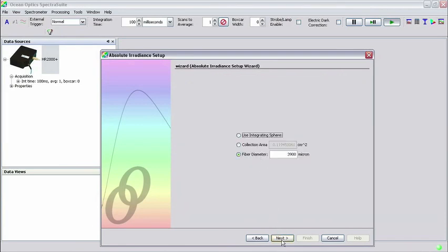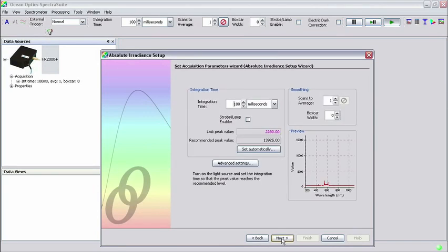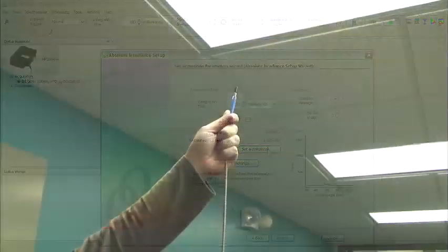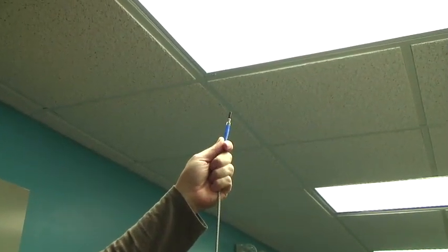In the next window, a fiber diameter of 3900 microns should be automatically populated. If so, click Next. At this stage, you should be pointing the cosine corrector at the sample that you wish to measure. In this tutorial, we'll measure the overhead fluorescent lamps that light our lab.